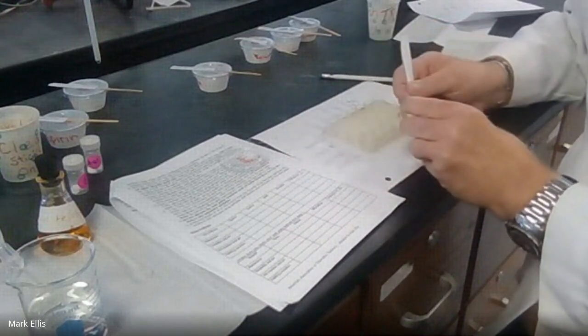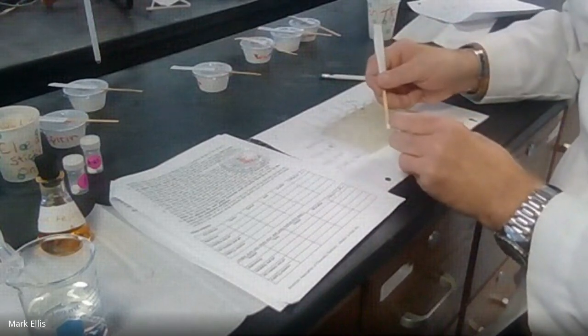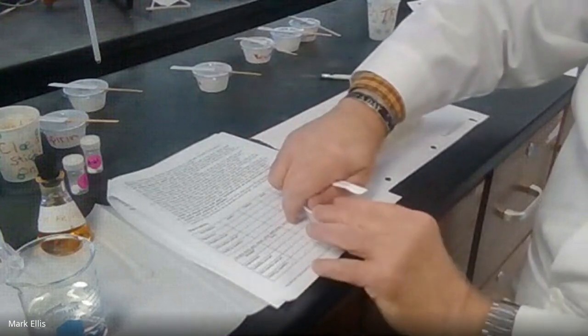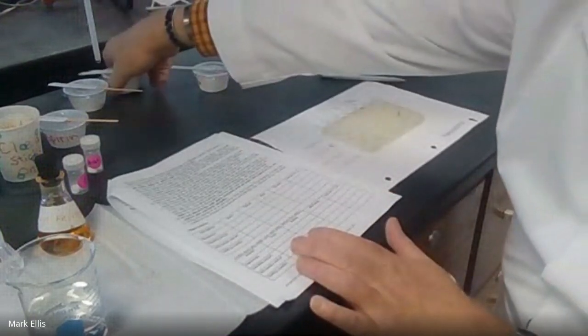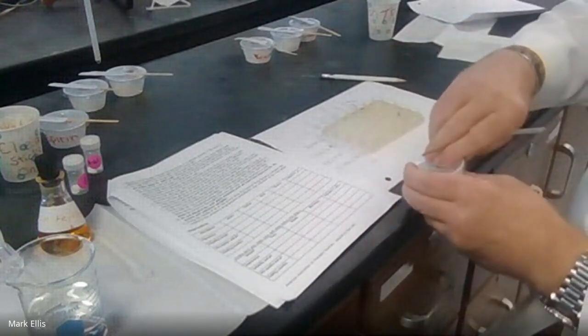And if you mess up and put something in the wrong pocket, you got to dump it all out and start all over. So this is why it pays to really pay attention and read your lab ahead of time. The next to the last one is Excedrin.